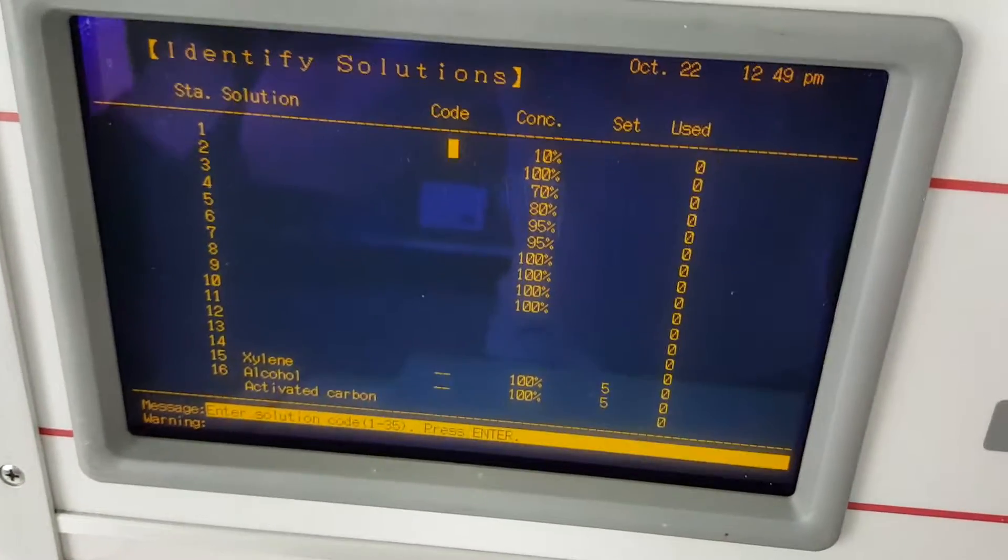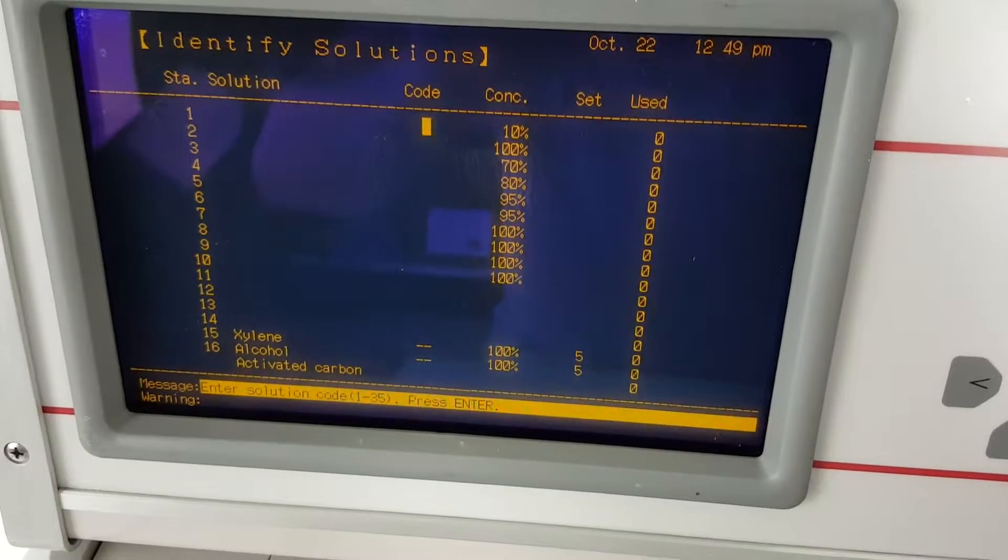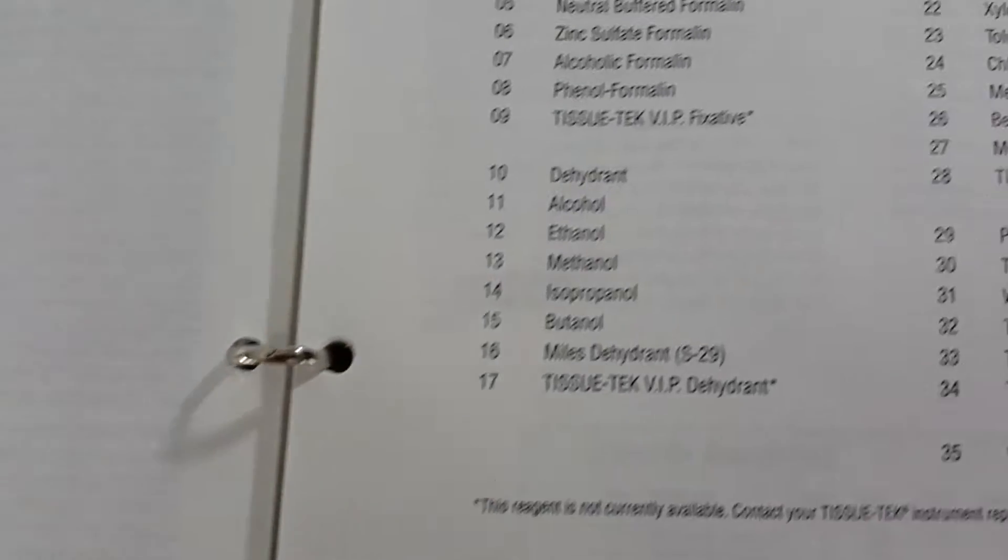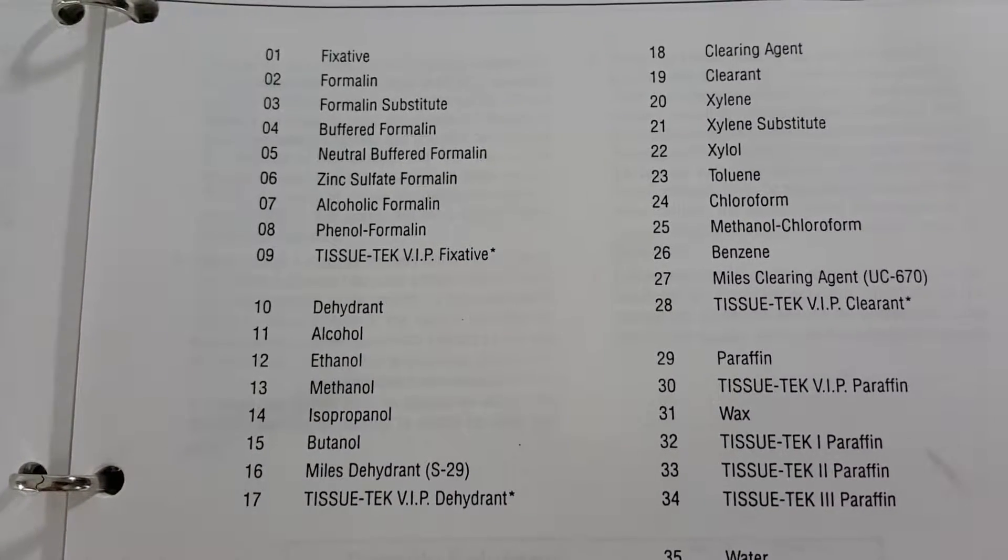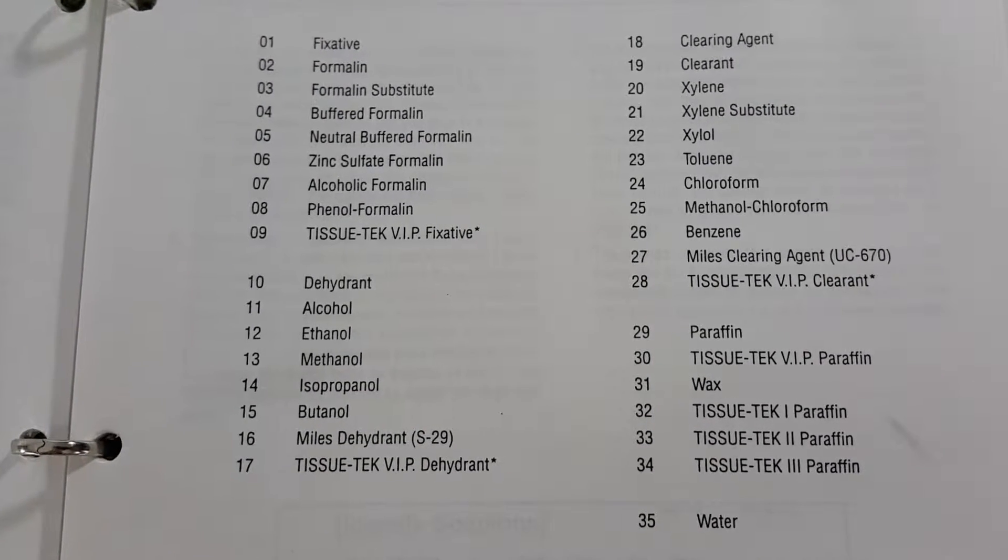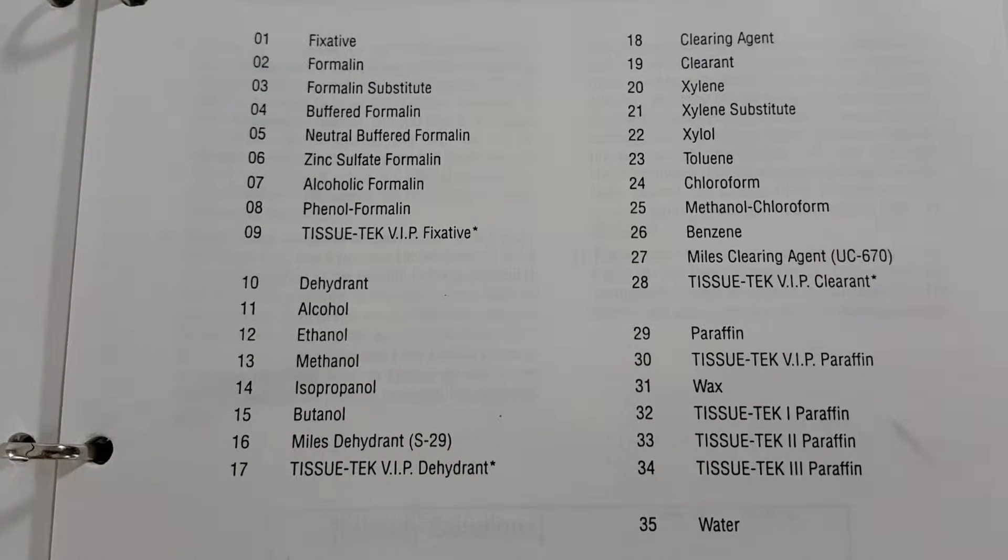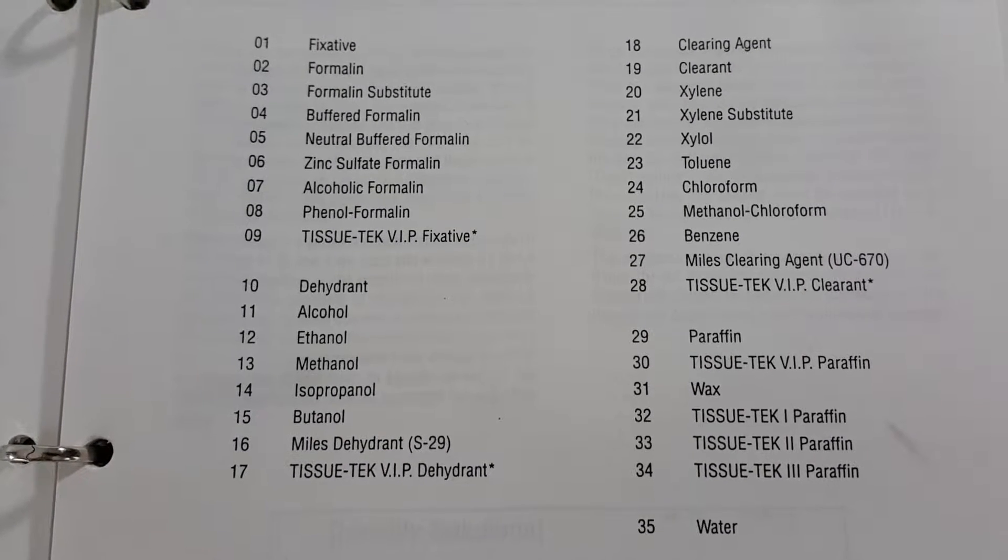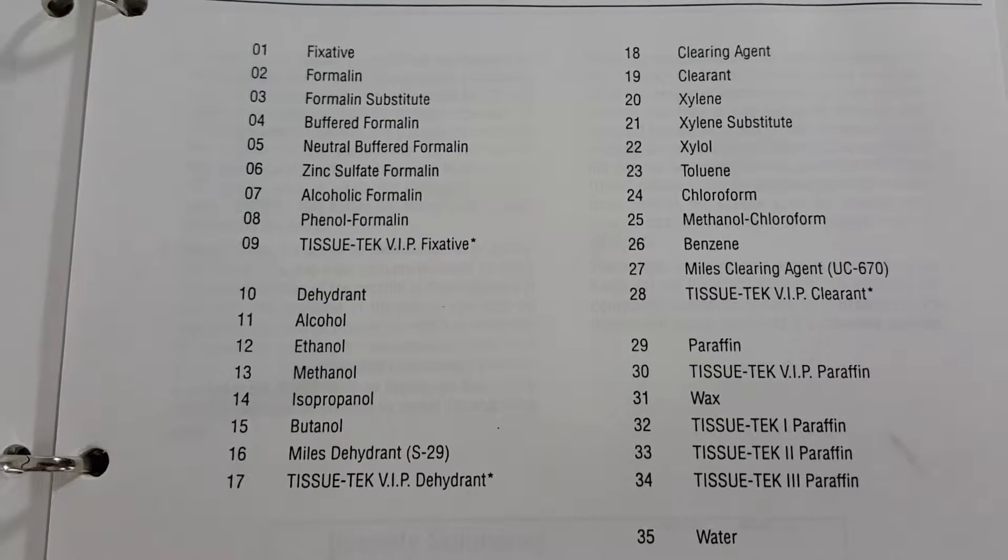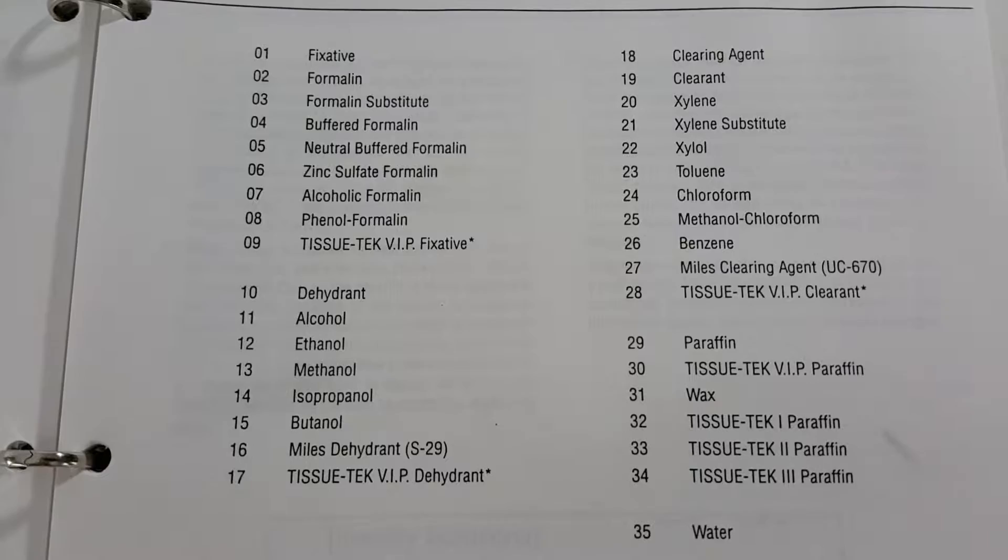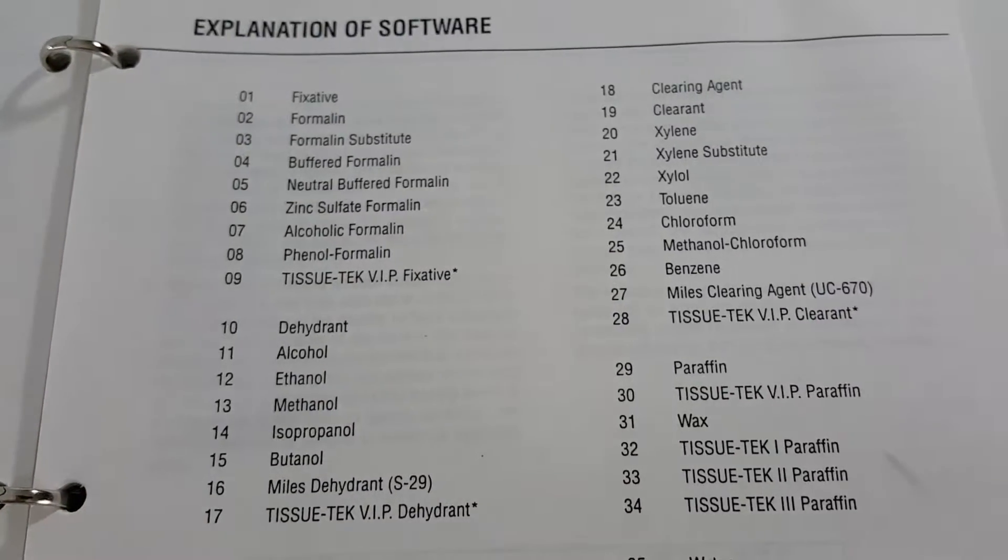Station one we are going to choose neutral buffered formalin. So I'm going to go to my manual and here are the codes for all the reagents that are programmed into this processor. As you can see neutral buffered formalin is number five. Those are for the first two steps. Then I'm going to go down to alcohols number 11 and then I'm going to go to 20 for xylene and the rest are cleaning and paraffin.